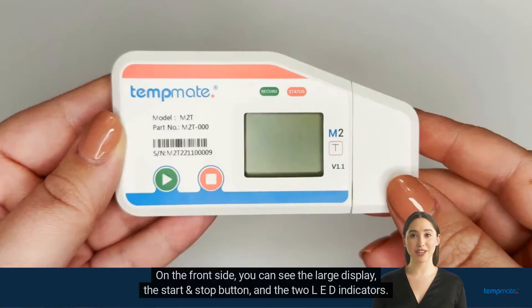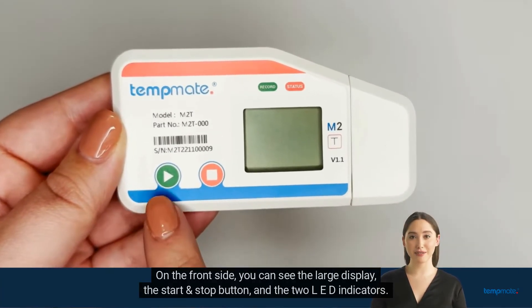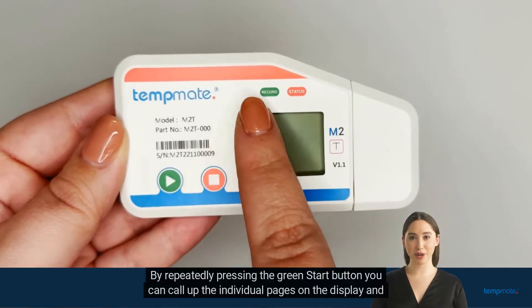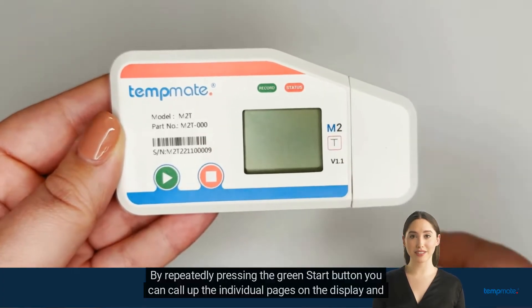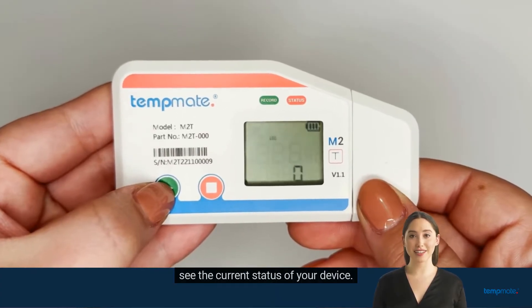On the front side you can see the large display, the start and stop button and the two LED indicators. By repeatedly pressing the green start button you can call up the individual pages on the display and see the current status of your device.